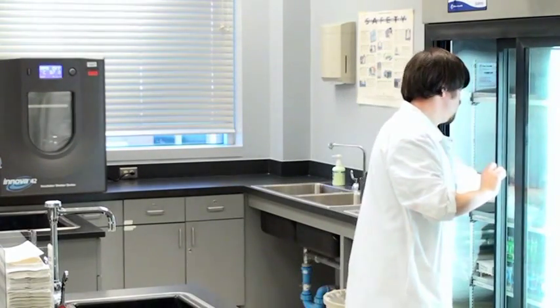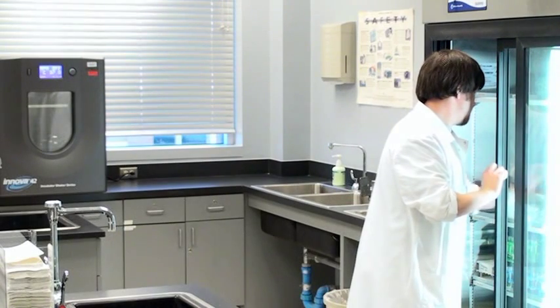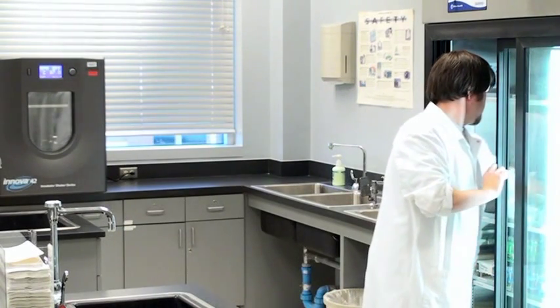While your hands are never completely free of microbes, effective handwashing technique reduces their number as much as possible.